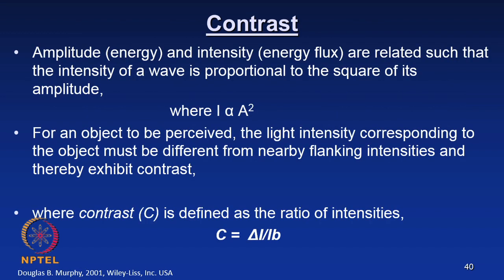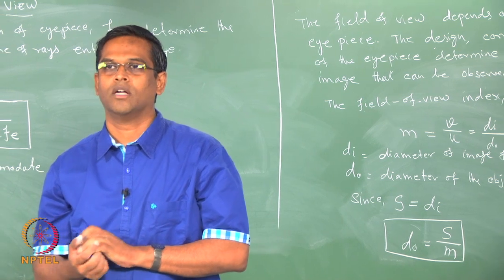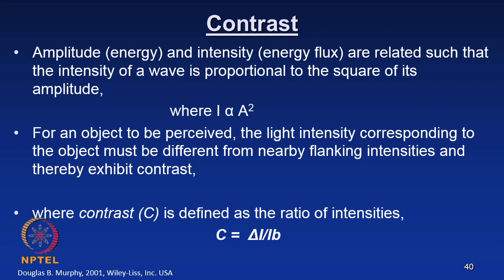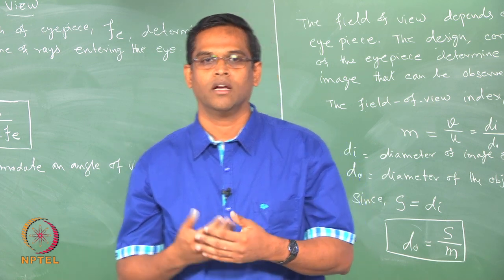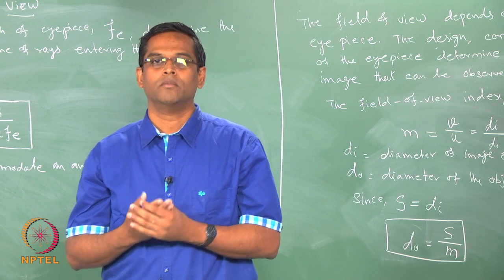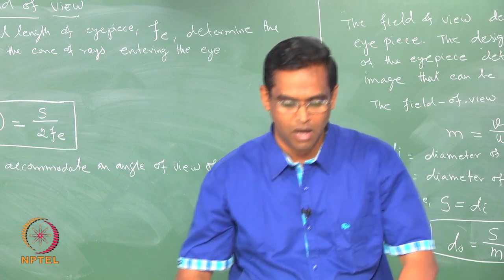Now we will go to the next concept called contrast. See, in most optical micrographs, or for instance any micrograph, people are interested in the best contrast and quality. So let us understand the term contrast. What is contrast? Let us look at the preliminary remarks.